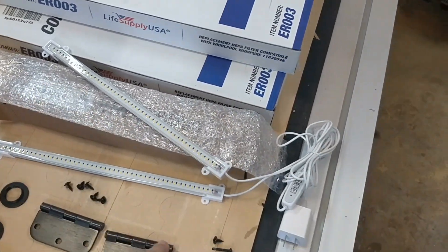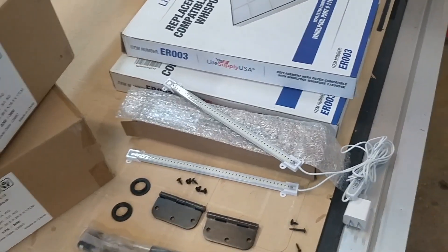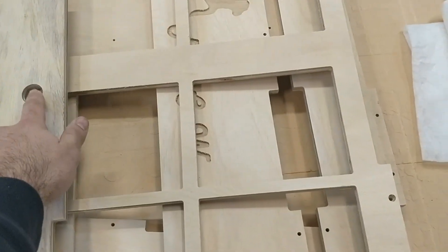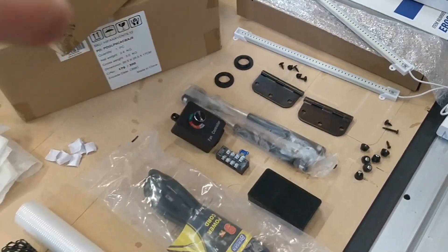You get two light bars that have three dimmable settings as well as an automatic turn-on and turn-off, so you just set the amount of hours you want it on and off. You get a couple hinges for the lid, and then two port covers — you feed your wires through this little hole right here in the back.